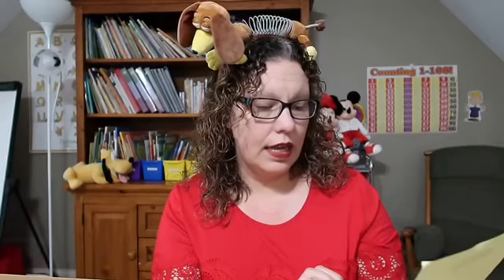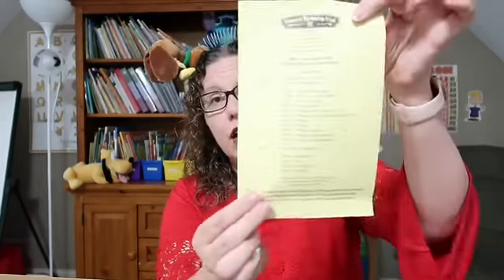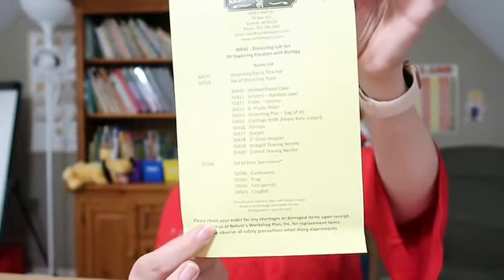There are a couple of papers in here. This pink paper gives you instructions about how to deal with the specimens — how to store and take care of them. And then there is an inventory list of everything that's in the box as well.